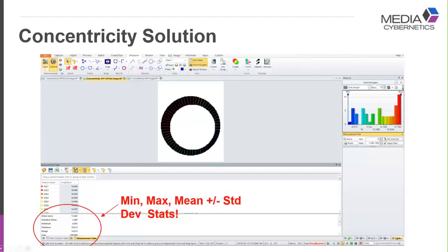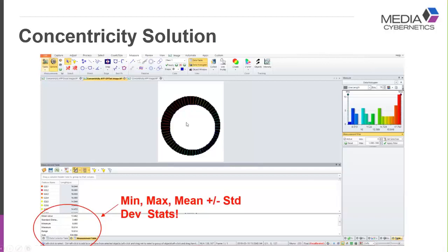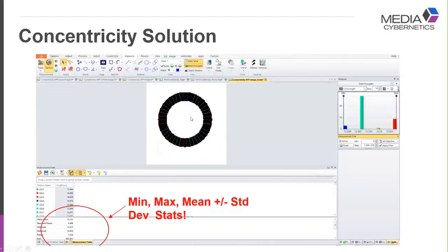The numbers of the line segments that are created will give an indication of how far off that is. If you look at this particular data, numbers which are offset, like standard deviation of the line segment length or the range, would be a lot larger.